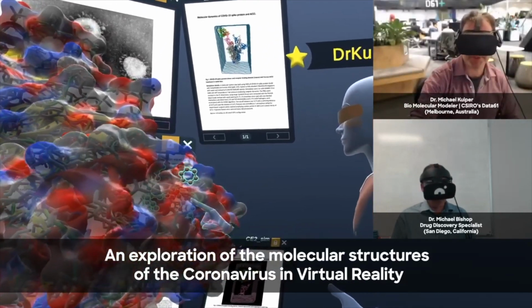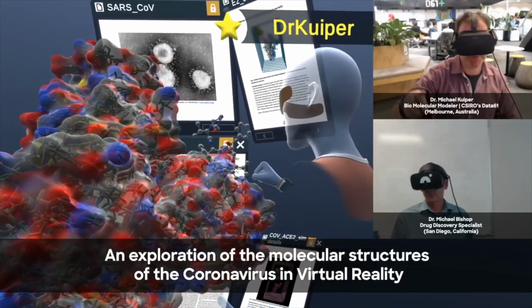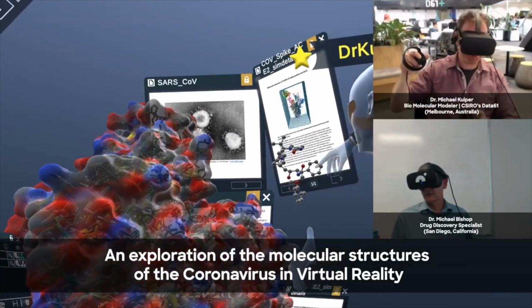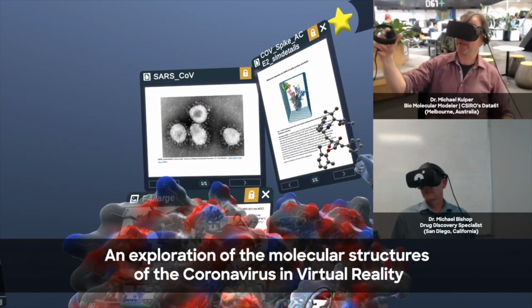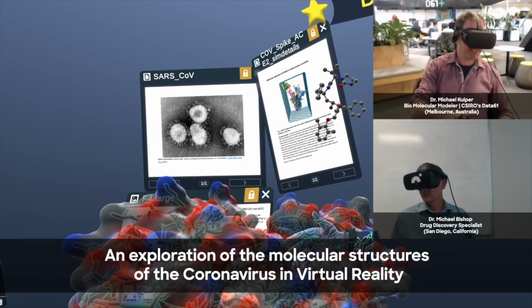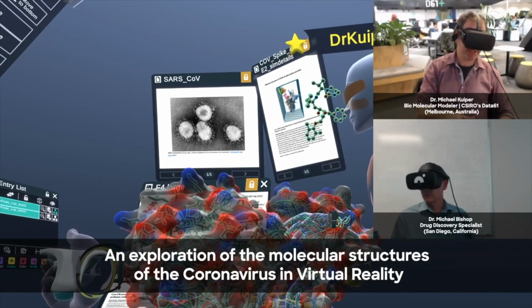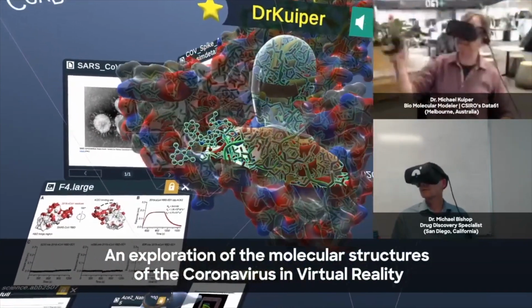And I believe some of the newer features will be able to visualize clashes as we're moving these molecules into the active site. Yeah, and we can modify these on the fly as well. So this is really quite beautiful here. I like this where I can take both the ligand that I've just pulled out of the active site, I can interrogate that active site, and if I want to, I can align them again, where it comes back together like that.